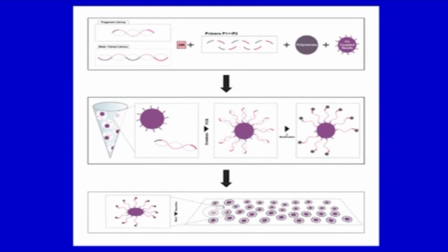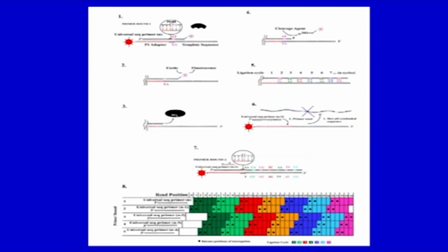So, this is how this reaction is carried out. These are beads here on which it is attached and PCR is carried out, and this is the real reaction here, where priming and ligation are 2 methods. If you can see on the screen, there is an adapter and there is a primer against that. Now, this fragment, which is the probe, has fluorescent material in here. So, this will be matching, and as it matches after the primer it will sit in here, and these are various probes in here.